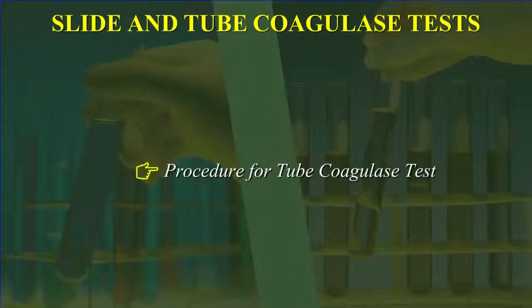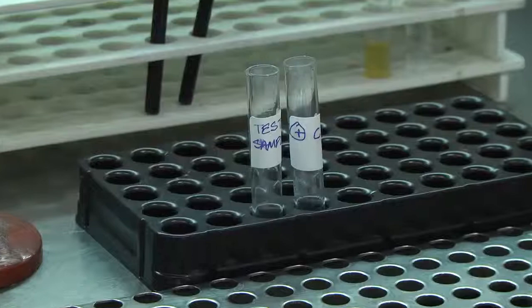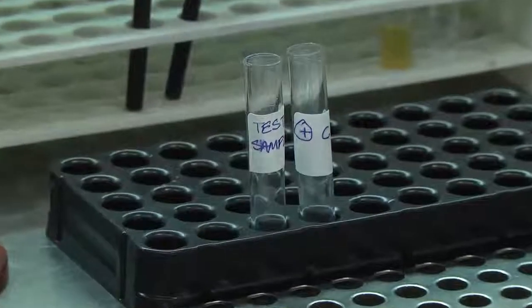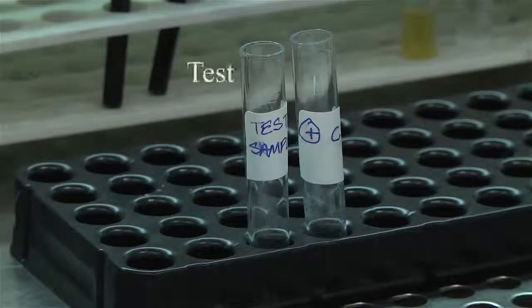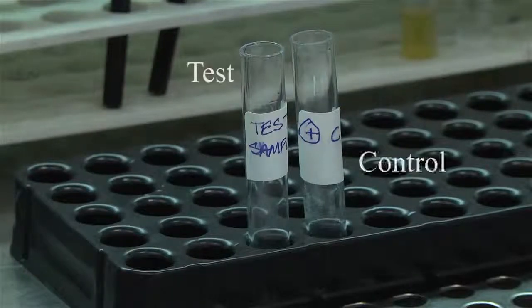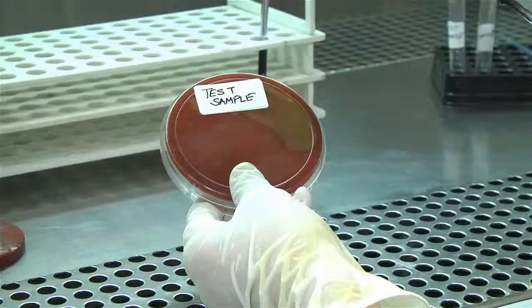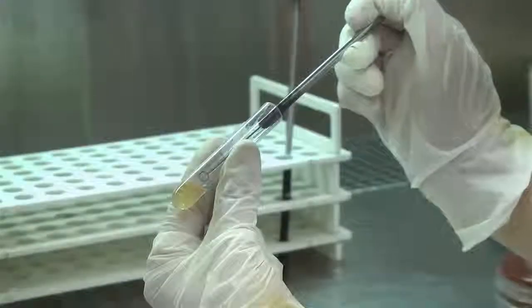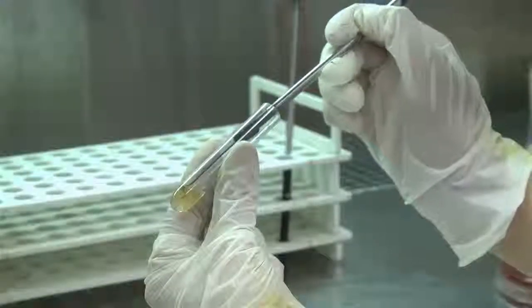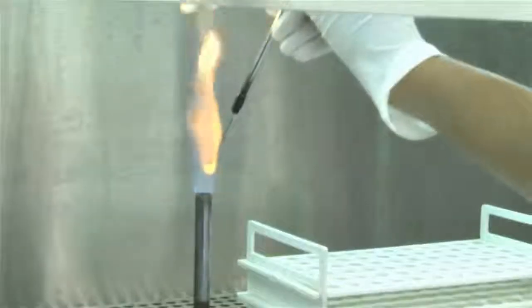Procedure for tube coagulase test. Take 0.5 milliliters of diluted plasma in 2 test tubes. Label one tube as the test and the other tube as positive control. With a sterile inoculating loop, pick 1 to 2 colonies of the test sample and inoculate in the tube labeled as test. Flame the loop.